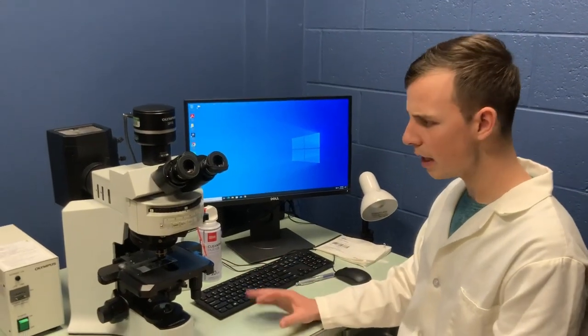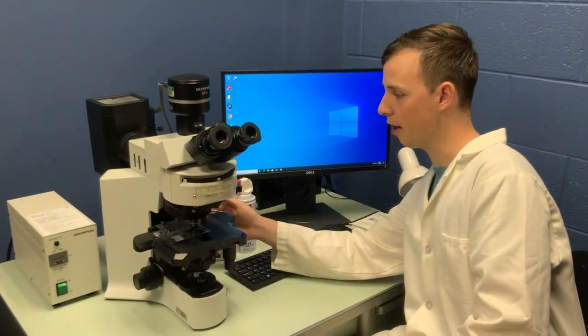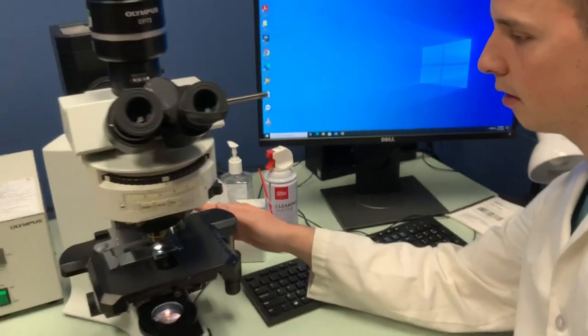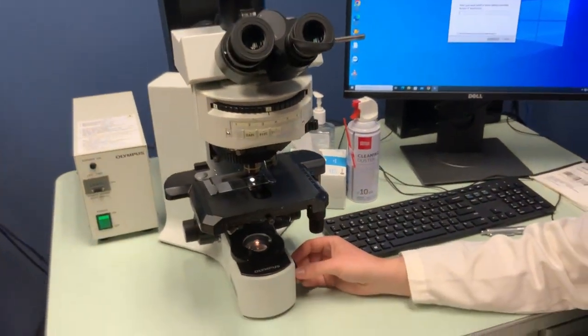Very simple — just to do light microscopy, the switch is over here on the right side of the microscope. Let me just turn this on, and you can see the light comes on. We can adjust the brightness with this knob right here.